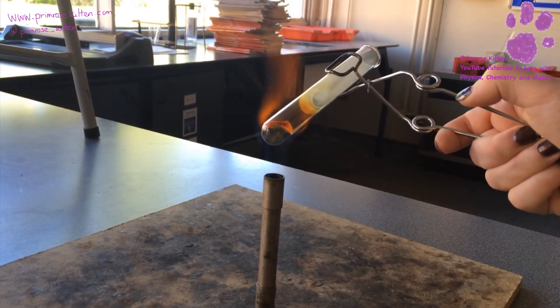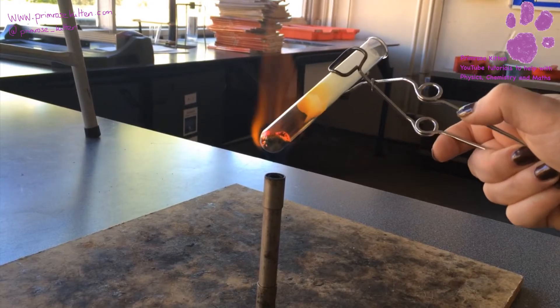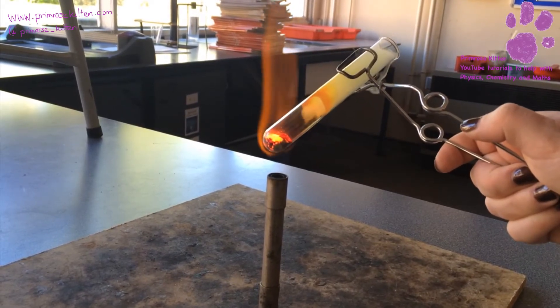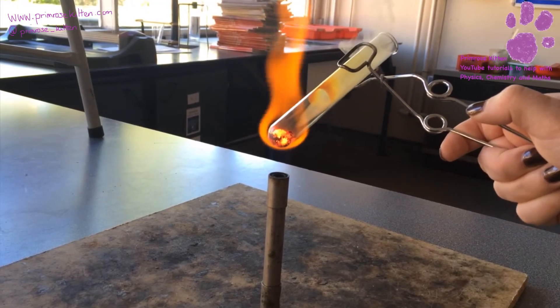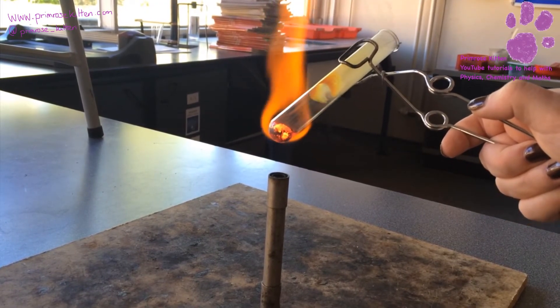Oh, starting to see it glow there — quite a bright glow. If I just tilt that, if you can see it — and that tells us that a reaction is taking place. So once it's glowing and you can see the vapor coming out the top, we can stop the experiment.